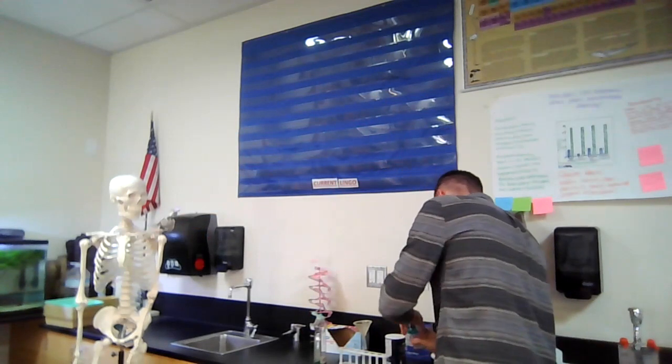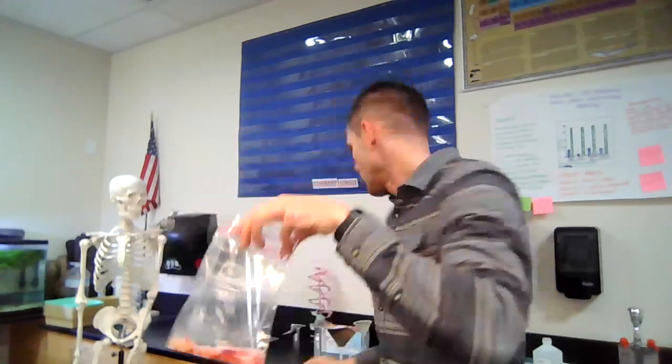All the chloroplasts, lysosomes, ribosomes, all this stuff is just exposed all over the place. All right, so I'm going to put this 20 milliliters of extraction buffer into the baggie. Pour it in. Again, seal it. You don't want too much air in there because then it might pop and make a big mess.